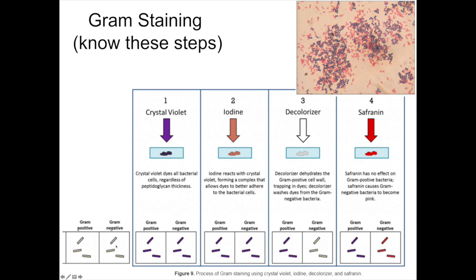Okay, and what this is showing you is you've got a sample of gram-negative. And so what would this cell morphology be? Would this be coccus, bacillus, or coccobacillus? That's right, that would be bacillus, both of these. Okay, so in this case, this is gram-positive and this is gram-negative. First step, you add crystal violet. It floods them, and it's a direct stain, positively charged, and it will stain all of the cells purple.